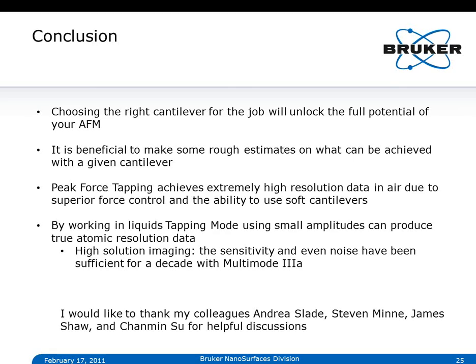Okay. So going back to the red blood cell data, how do you calculate the pull-off force when using the functionalized probe?